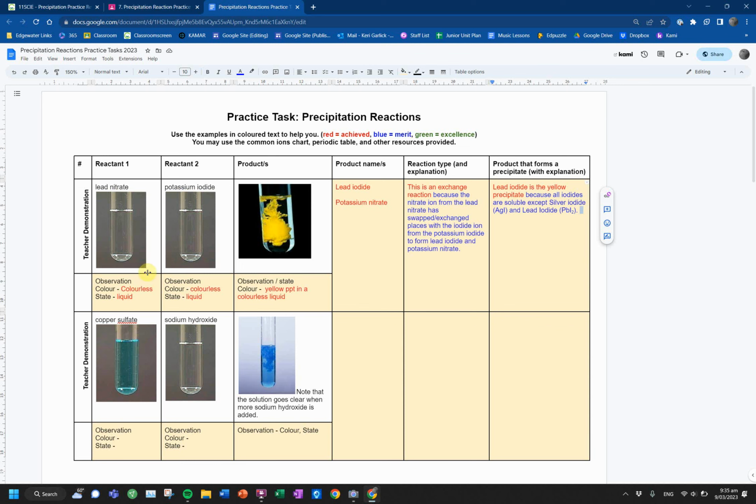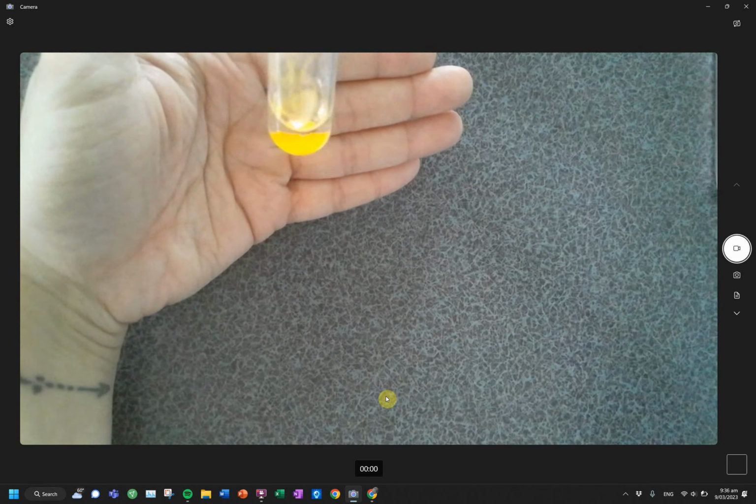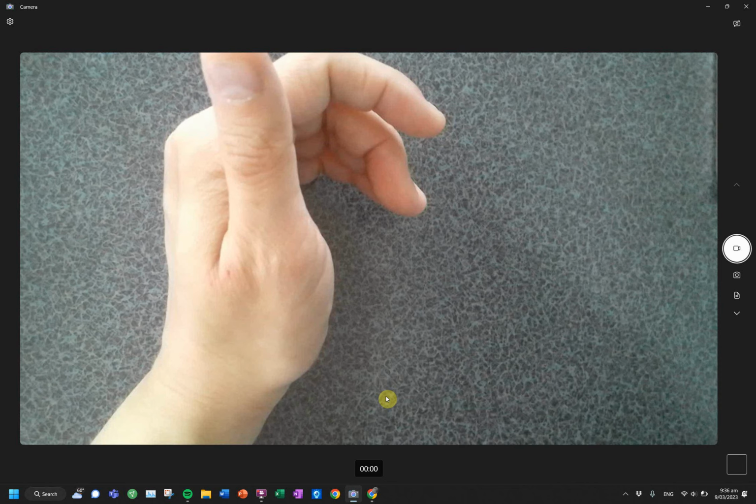The first demo we looked at on Tuesday, and I still have the test tubes here. One of the things I said about those test tubes was that the precipitate was going to sink to the bottom and you'd have the remaining solution on the top, and we can see what color it is. I'll put it on the document camera so you can see what I mean. You see how it settled out? It's precipitated. So keep that in mind.